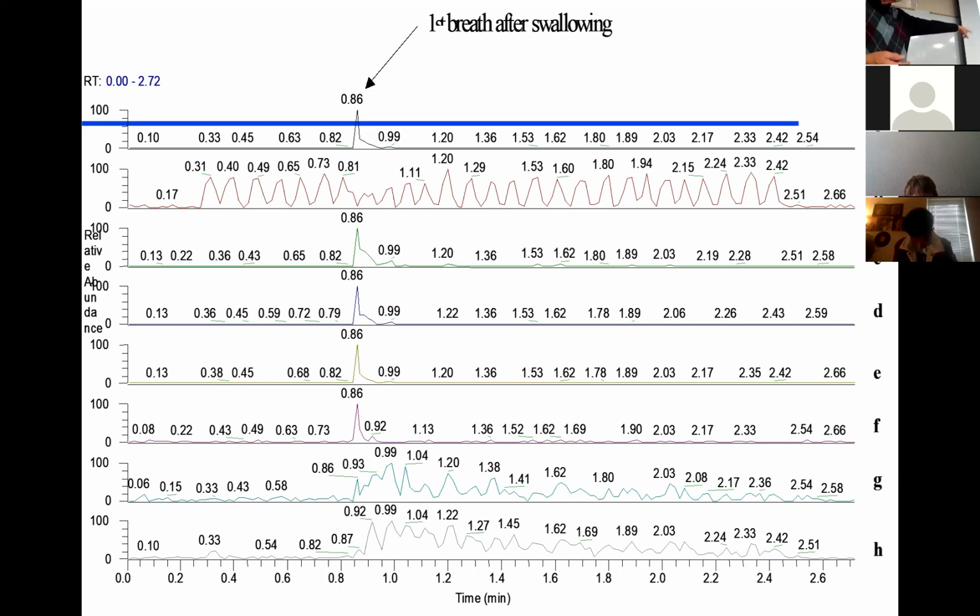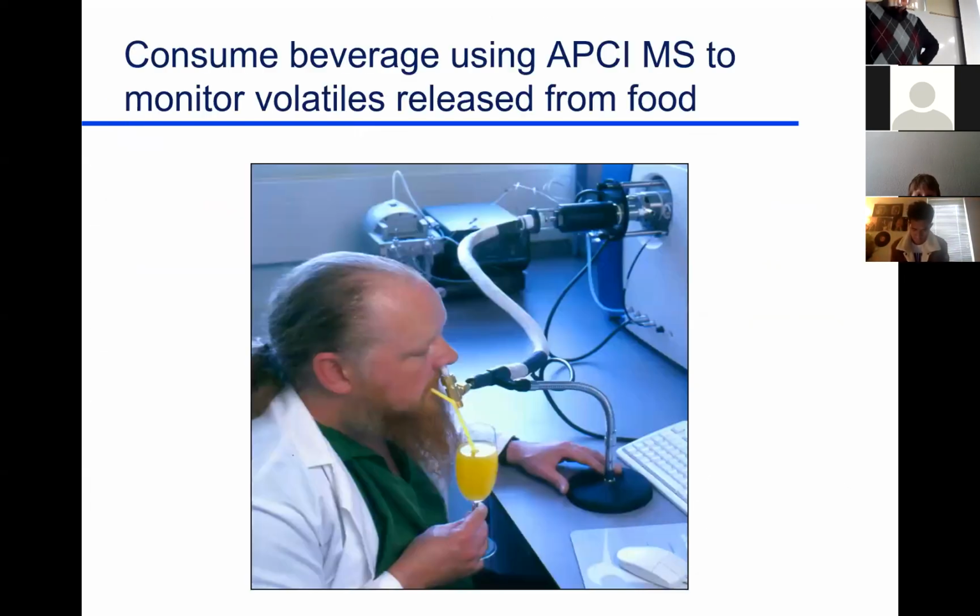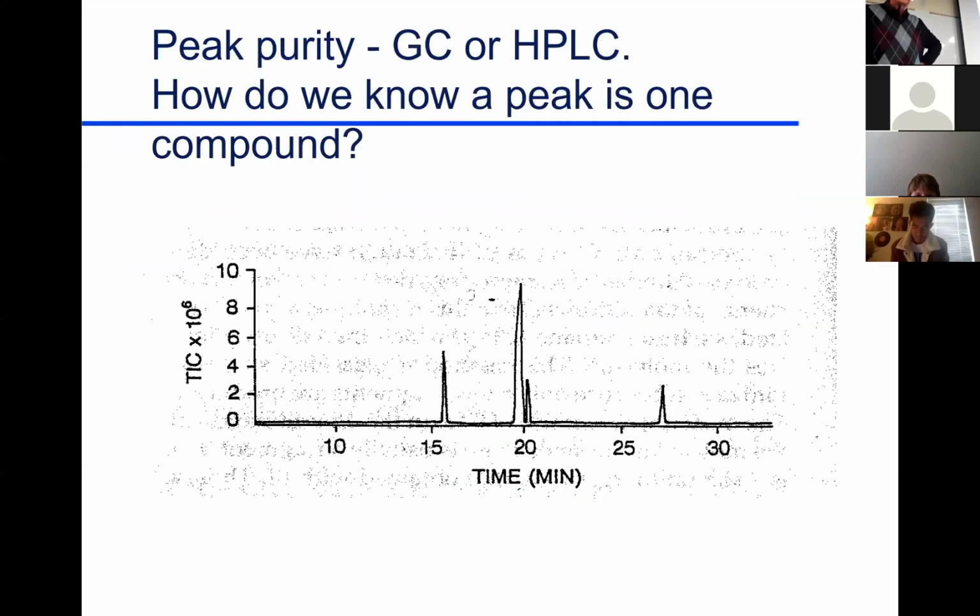However, some compounds in there continue to come along. So some of these middle ones in here, very volatile, they go away. The bottom ones, they tend to persist. So it starts telling us something about how we perceive things, what influences how we perceive flavors. So it's, again, just a fantastic tool for those kinds of purposes. So those are two things that we use the mass spectrometer for in the flavor group.